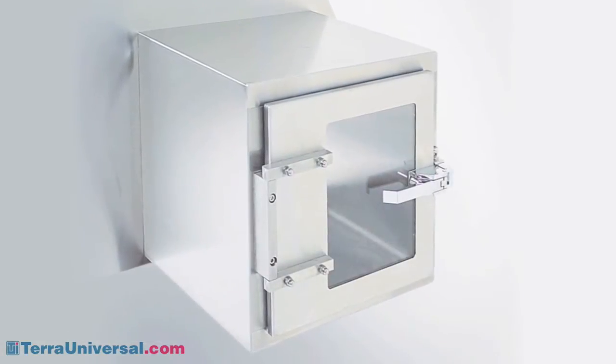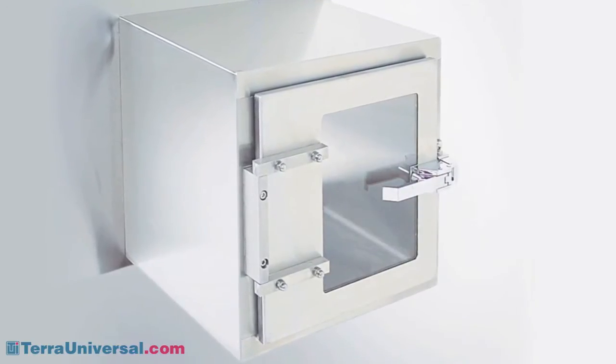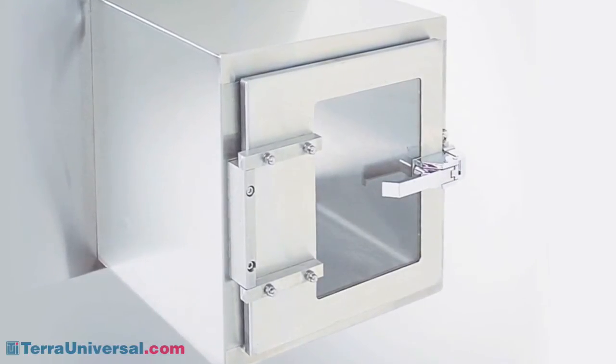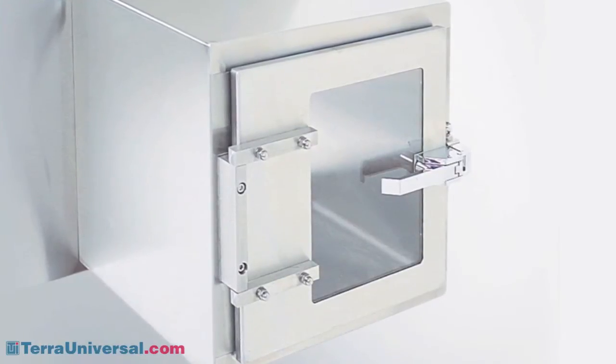All Tera glove boxes feature 304 or 316 stainless steel lift latches, hinges, and other hardware. Unlike chrome-plated components, which can flake, corrode, and contaminate after repeated use, stainless steel hardware supports clean operations.